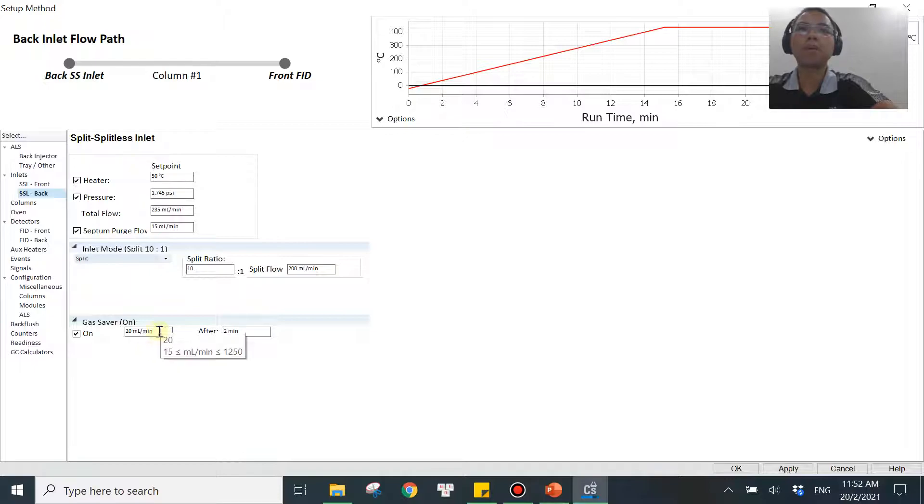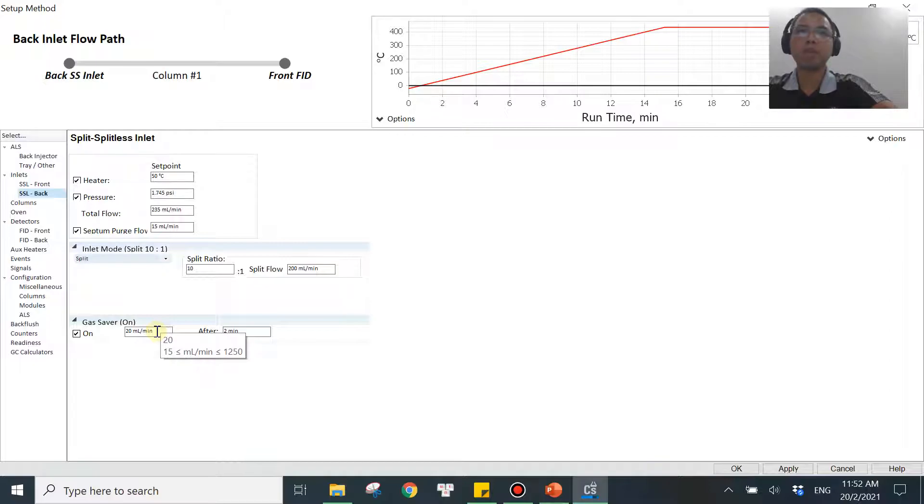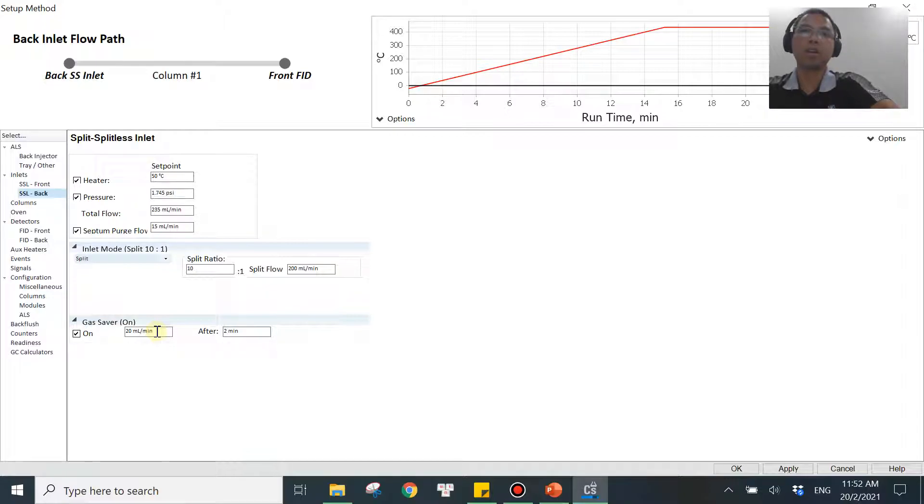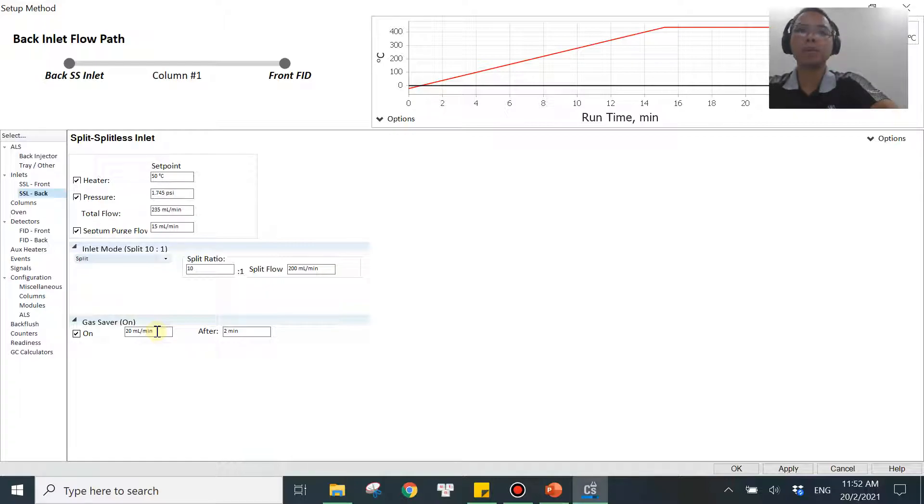But we need to know what's the minimum and what's the maximum value we should set over here. So if you hover the mouse at the field, it will tell you that the minimum is 15 mL per minute. You don't want to go lower than that because you want to push the split vent float efficiently to remove any wicks of the sample or whatever from there. So 15 mL is the minimum.